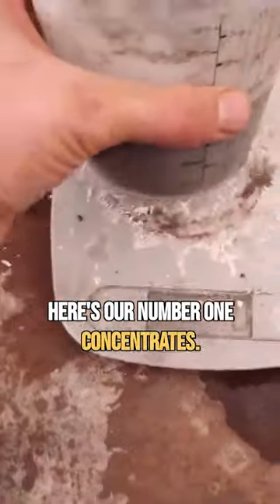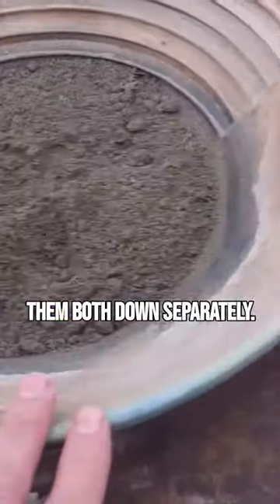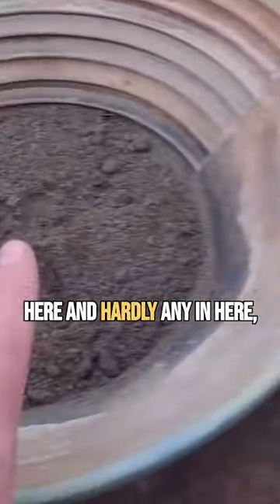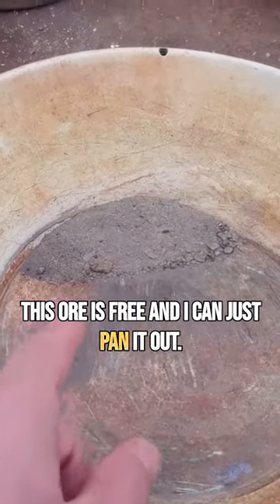Here's our number one concentrates and here's the number two. What we're going to do is smelt them both down separately. If there's a bunch of gold in here and hardly any in here, we're going to know that most of our gold in this ore is free and I can just pan it out.